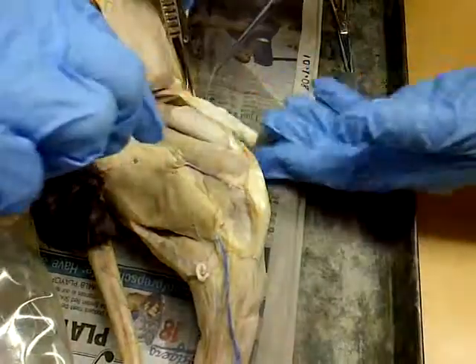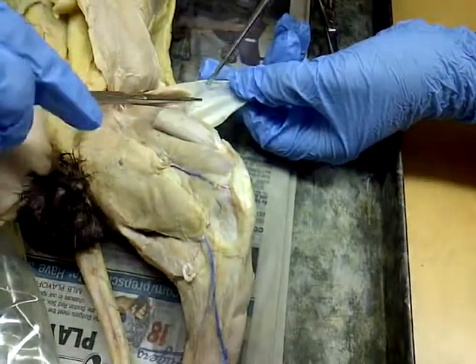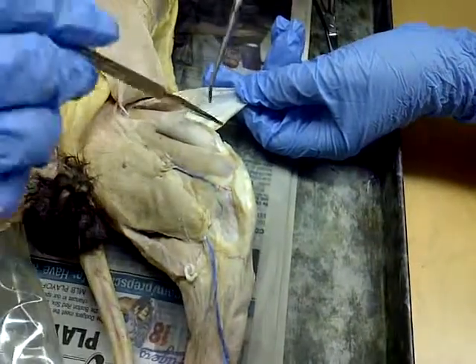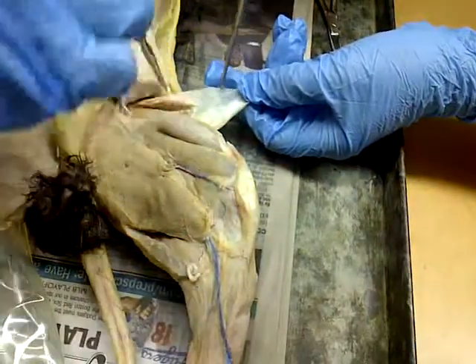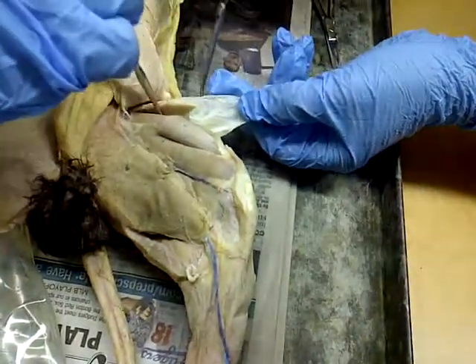And this one sounds like a latte you get from Starbucks. It's the tensor fascia latae. I'm just kidding, but yes, and it's mostly tendon. You see how it's got a little bit of muscle right here, but it's mostly tendon. That's why it's called the tensor. It's a lot of fascia material and tendon material.